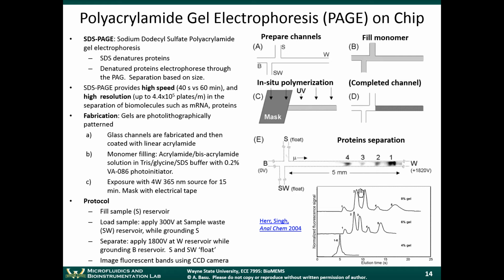Otherwise, there was a point early on when engineers had the ability to miniaturize things using MEMS technologies, using photolithography. So engineers started miniaturizing everything. And in some cases, there was no motivation to actually scale a device down. They just did it because it was cool. It was interesting, right? Oh, we can make this very small. And that in itself has value, of course. But whenever you're doing any type of technique or device, think about the benefits of miniaturization.